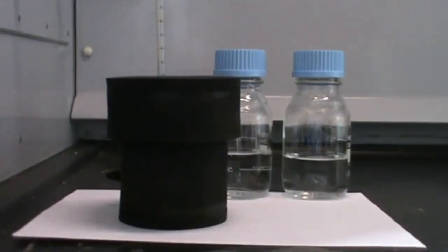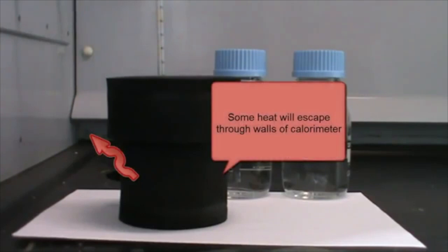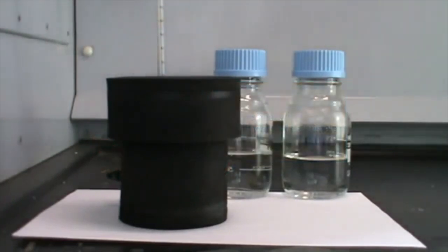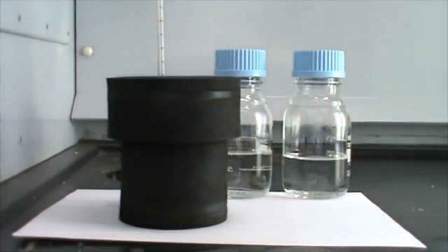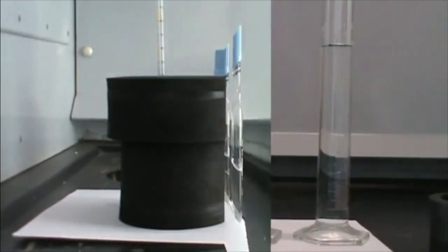The problem is though that even though the calorimeter is insulated, some heat will still escape through the walls of the calorimeter. It's not perfect. So we need to first of all calibrate the calorimeter to see how much heat will be lost through the calorimeter.